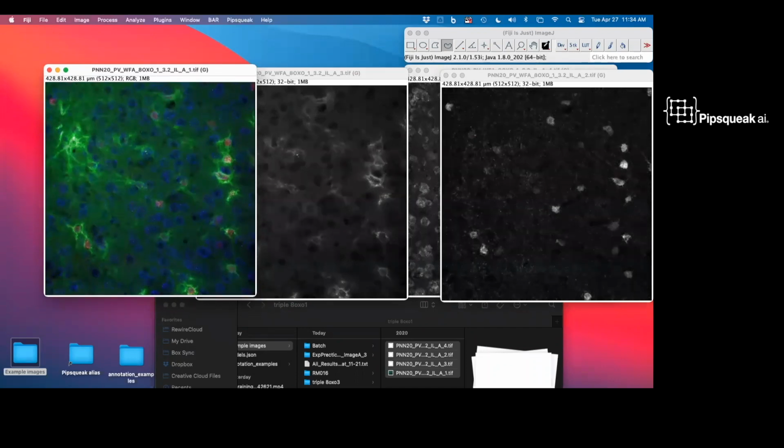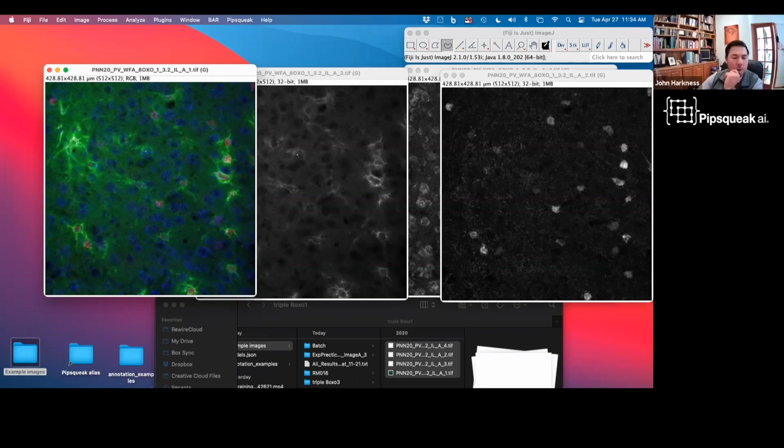But he seems like he's asking about two different types of cells with the same fluorophore, which would be a bit different, I think, John. Oh, right, I'm sorry. Yeah. So let's see, what's a good example? Well, CFOS is kind of an example of that, or DAPI, difference in morphology. Yeah.